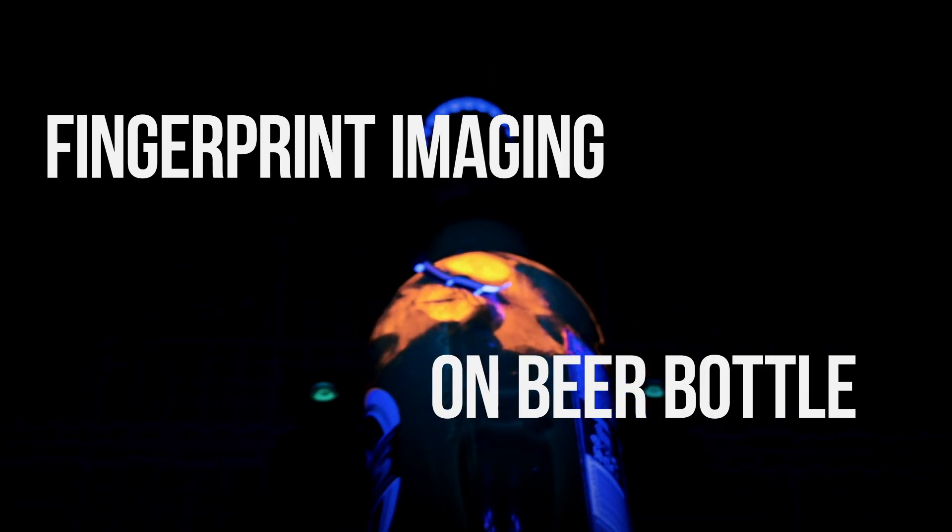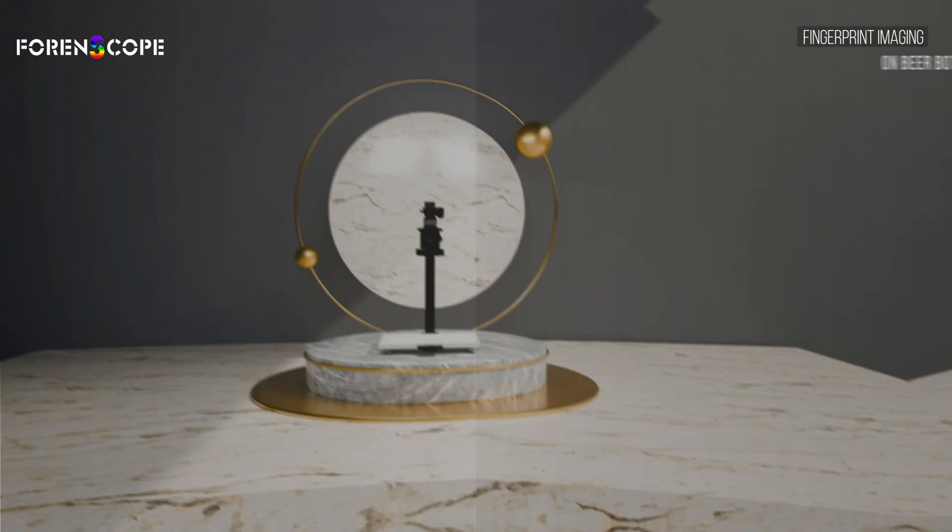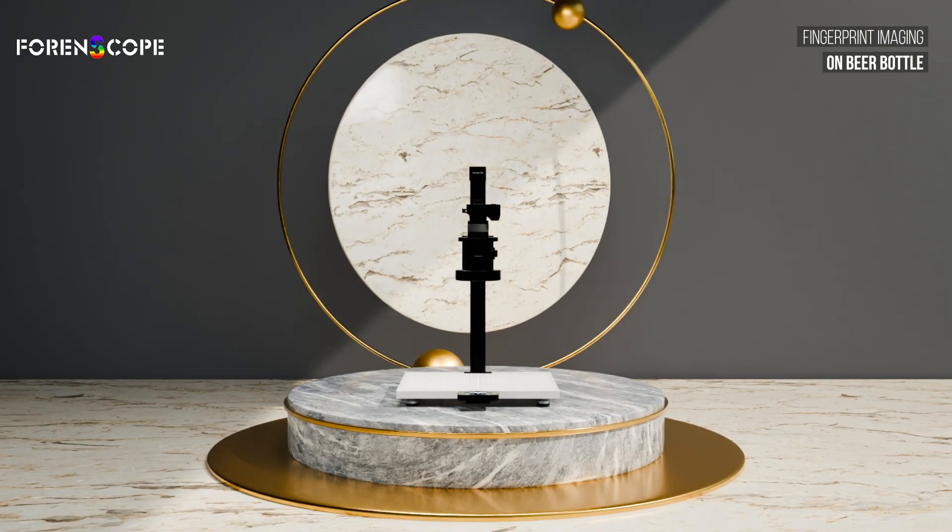Capturing fingerprints on a curved, reflective glass bottle has always been a challenge. But with the Contactless Lab Ultra, we've mastered it.